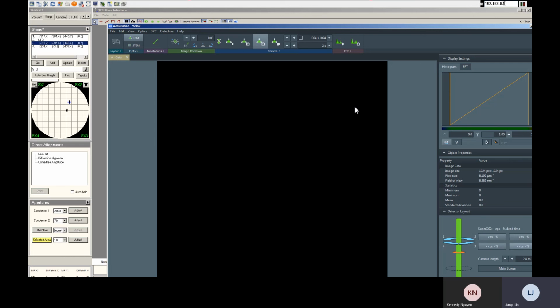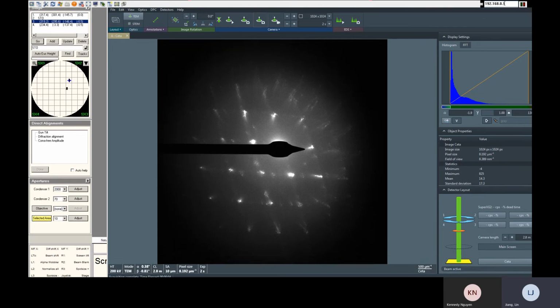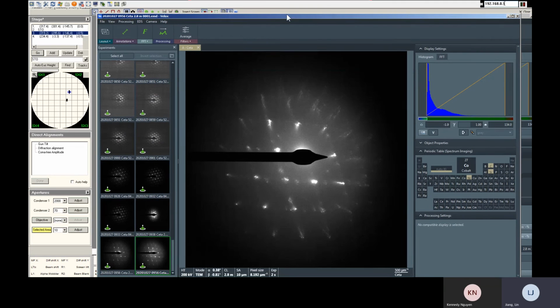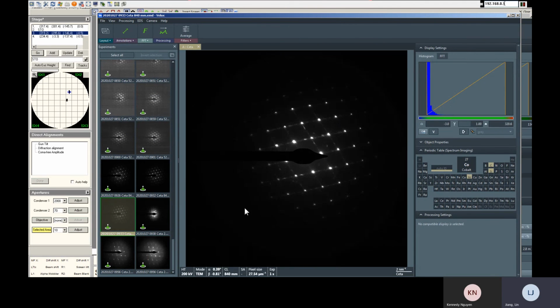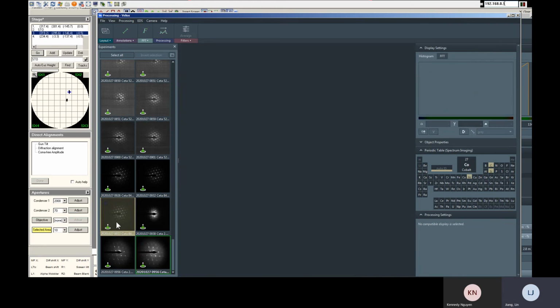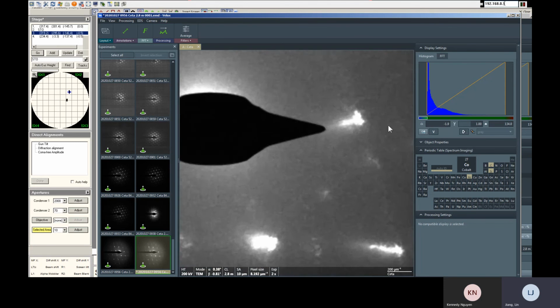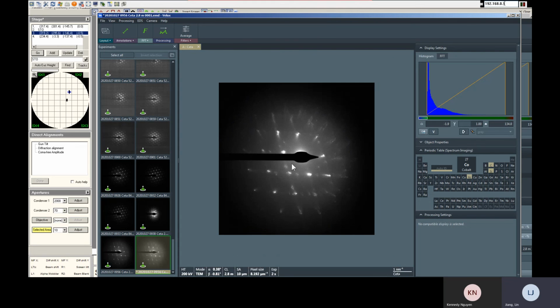So I would say for the nanoprobe mode, you don't get as good a diffraction pattern as in microprobe mode. This is the diffraction we get, right? For microprobe mode, we get a much better one. Is nano supposed to be better or no? It's supposed to be a little bit better. Because right now it seems we have some microscopy issue, I'm not sure.